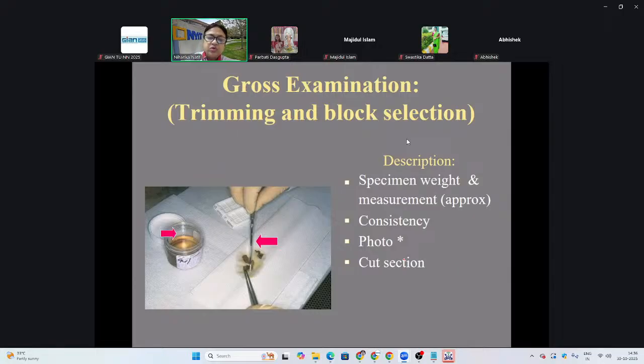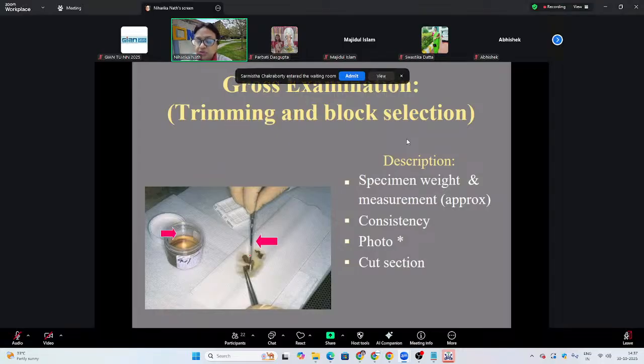This is just to show you that there has to be an ideal size for the block. This one really came in right after that picture. There has to be an ideal size for the block in order to be fixed, and that is all dependent on where it goes, how much solution there is, etc. And the section has to be sliced and cut if it was too big, but with extreme caution so as not to damage the tissues that you want to look at.